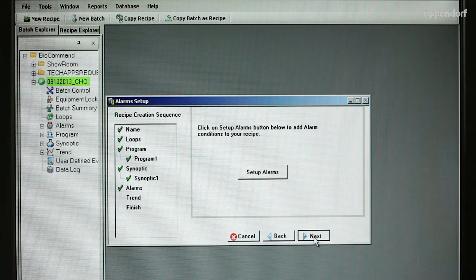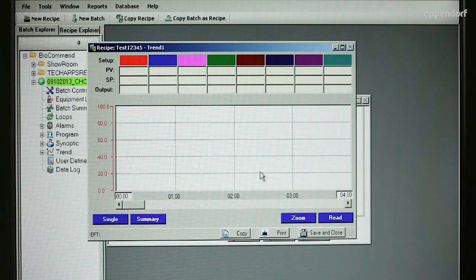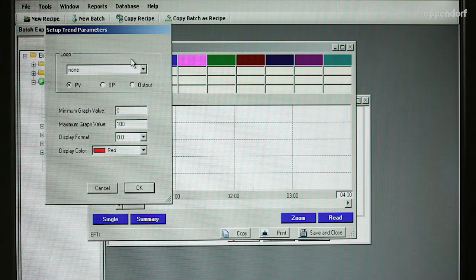When you click on the Create Trend button, the Trend screen will open to allow you to plot loop activity over time.